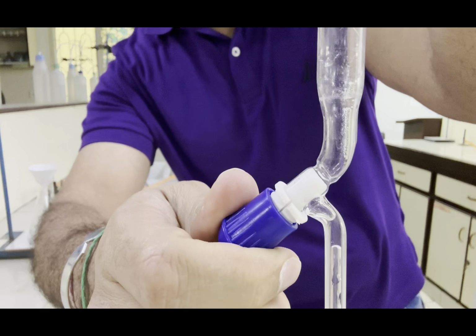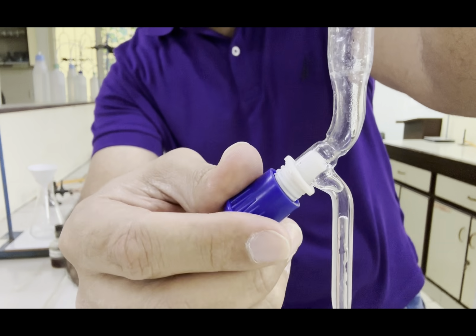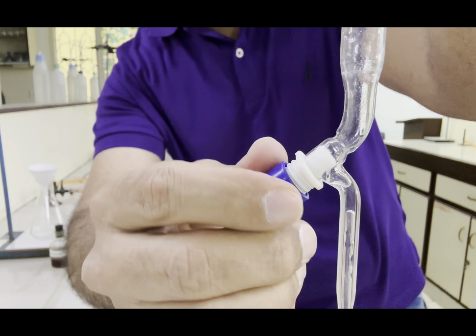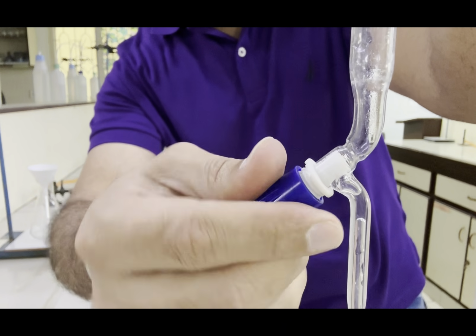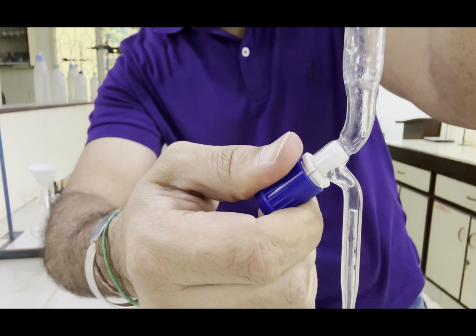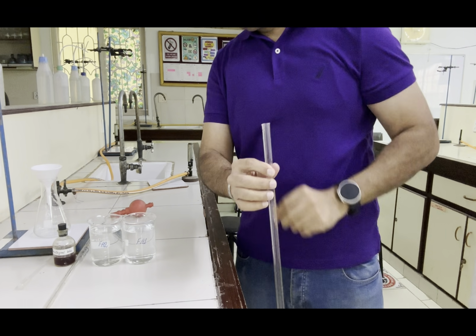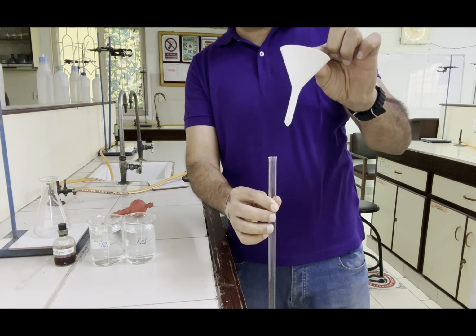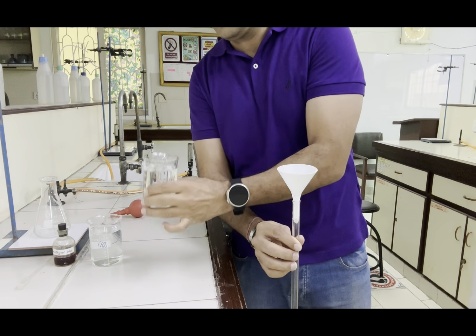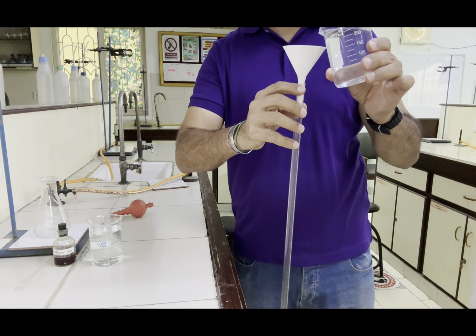You can see the space: if it is revolving anti-clockwise, the space is opening up, and if you close it like a normal tap, twisting it towards the right, the tap is closing. So we will close it first, and now we will put a funnel here and we will pour our FA1 solution through this funnel into the burette slowly.